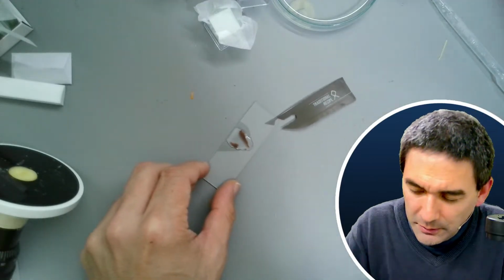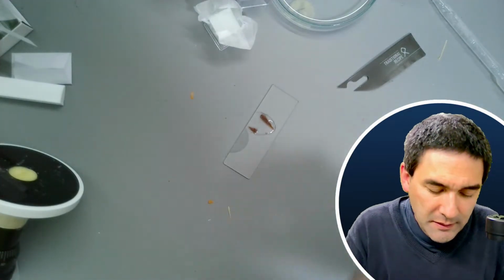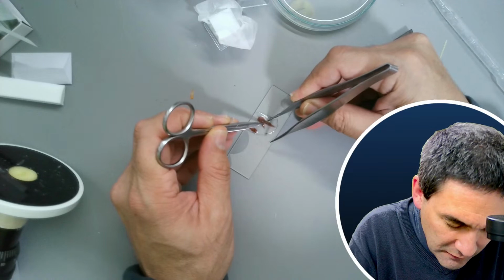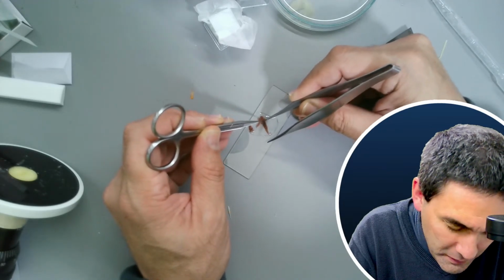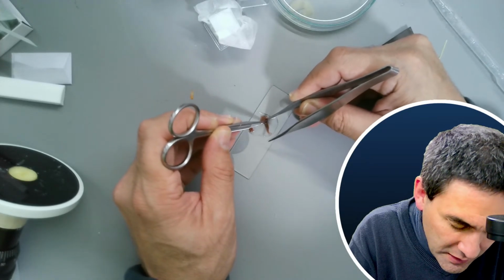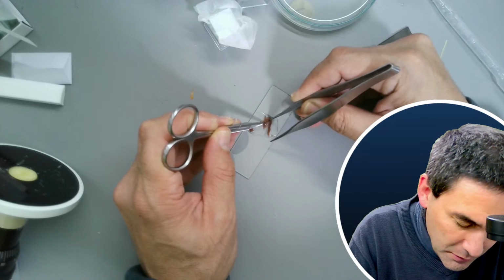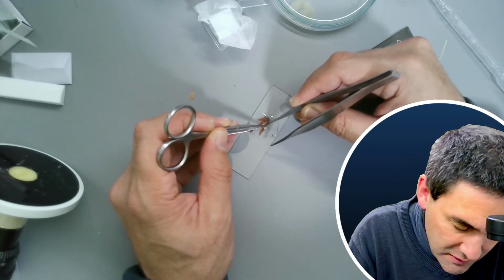I don't know if I'm able to separate this, and maybe this way. It's starting to become softer. My hope is, because I've done this already with chicken meat some time ago, and I was able to actually look into the individual muscle cells.